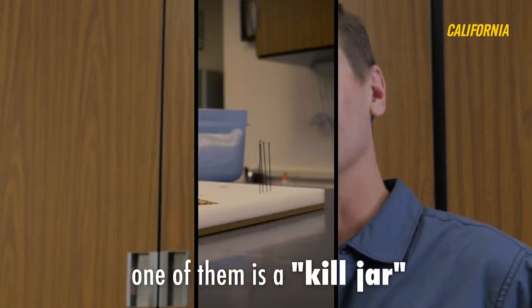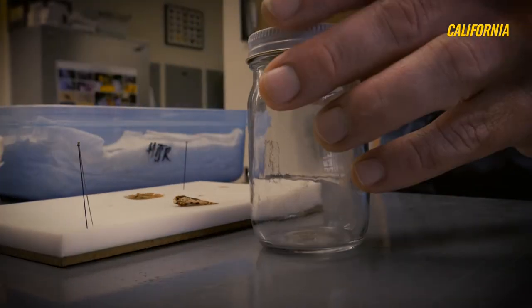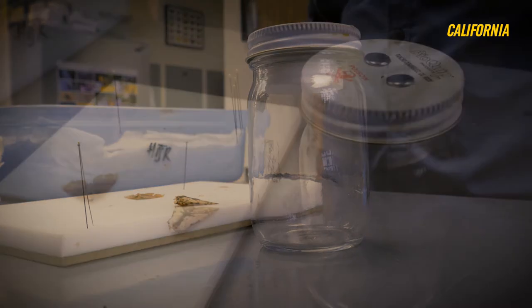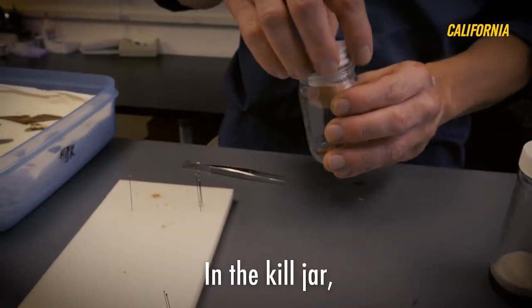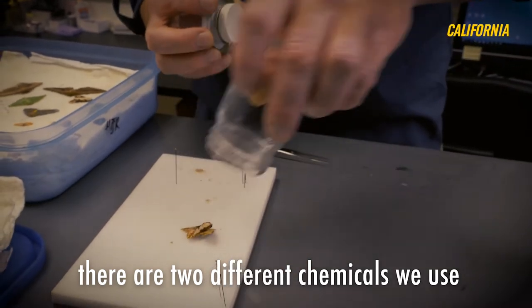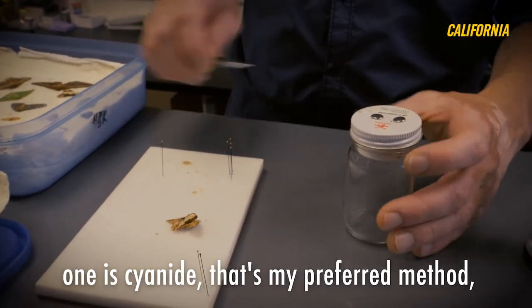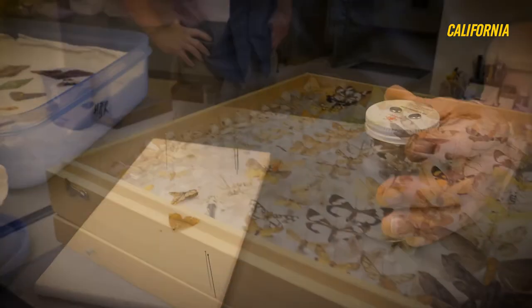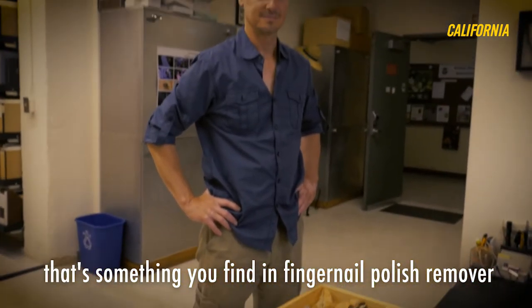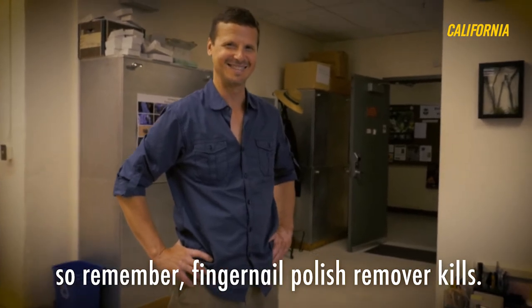One of them is a kill jar. In the kill jar, there are two different chemicals we use. One is cyanide, and that's my preferred method, and the other is ethyl acetate. That's something you find in fingernail polish remover, so fingernail polish remover kills.